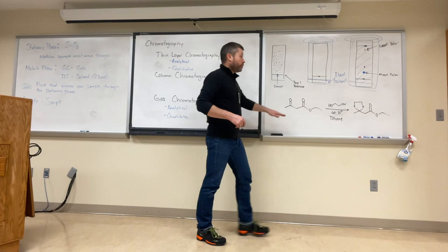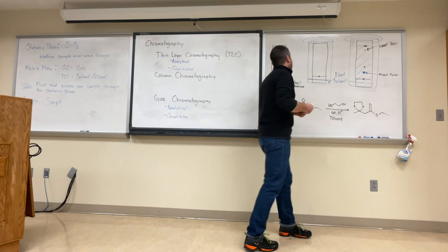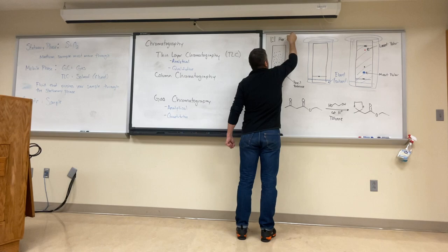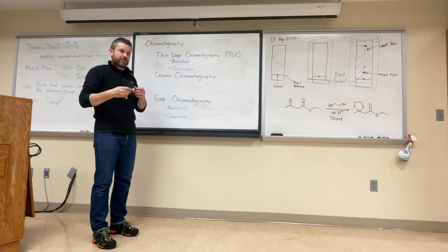You don't know what solvent system to use to analyze this. All right? I'm going to have you start with a solvent system of one to one hexanes to ethyl acetate. Right? It's a good starting point.